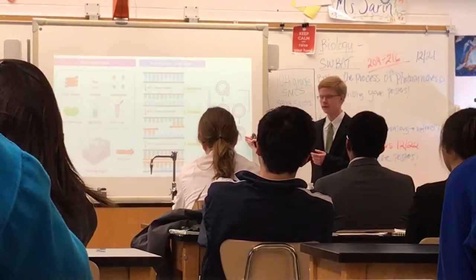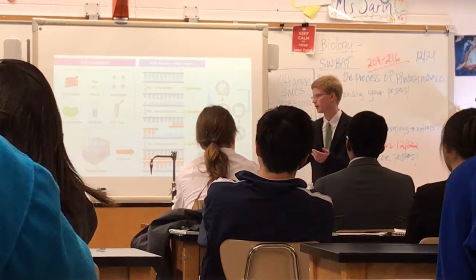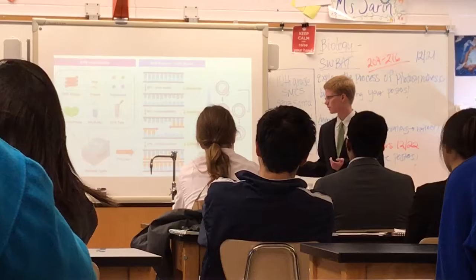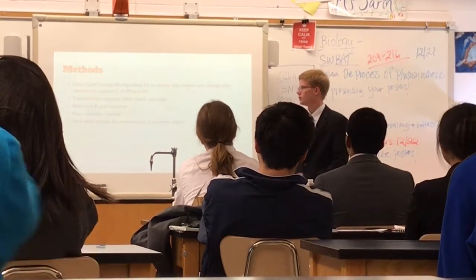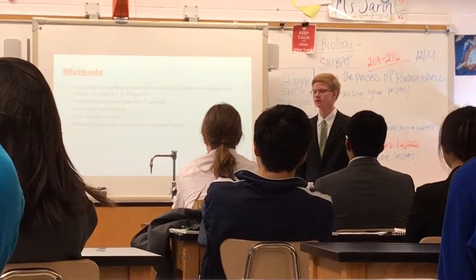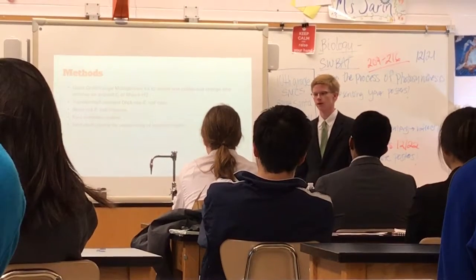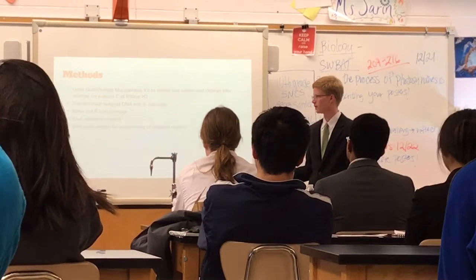And then once you digest the methylated template strand of the DNA, so it's no longer there, in theory you're only left with the DNA you want, the mutated DNA. So I used this QuikChange kit to delete one codon in the C subunit of RNase H2, and I changed another one to create this mutation.